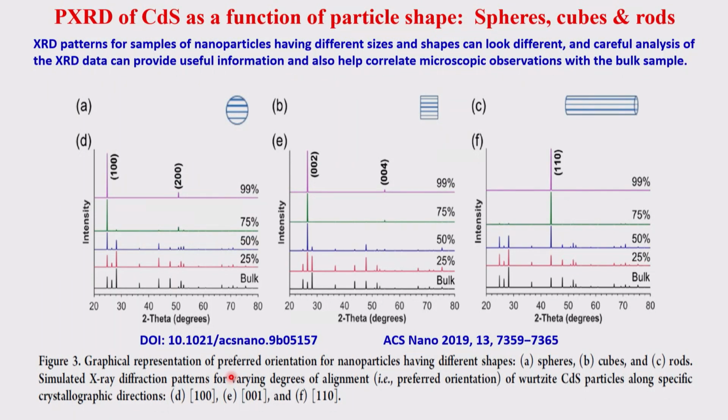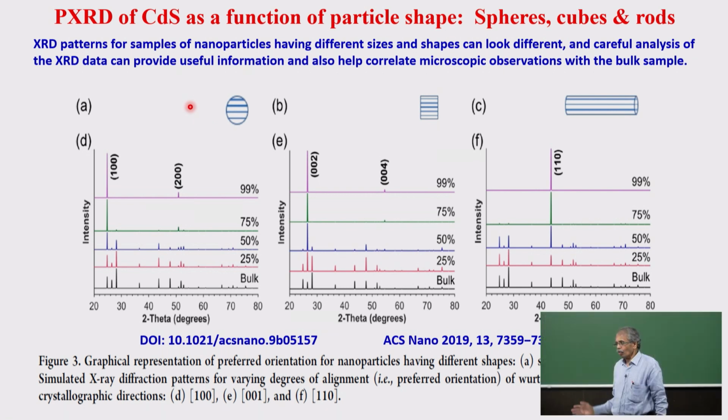Now let us look at how a shape variation. These cadmium sulfide particles, or quantum dots, are dots when they are circular, but there can be nanoparticles when they are other shapes. You can say the shape is of this kind, of this rectangle type, of rod type, and many shapes are possible. These are the major kinds of shapes that are taken.